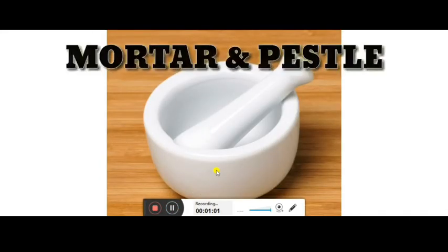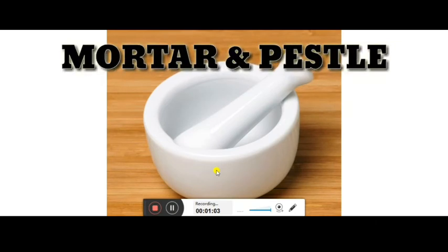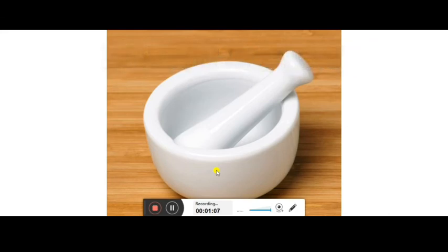This is called the mortar and pestle. Shapes may vary. You might have seen at home in the kitchen that some things can be made into paste form or powdered form with the help of a mortar and pestle. This is also made up of porcelain, and solid substances can be ground to powder with the help of the mortar and the pestle.